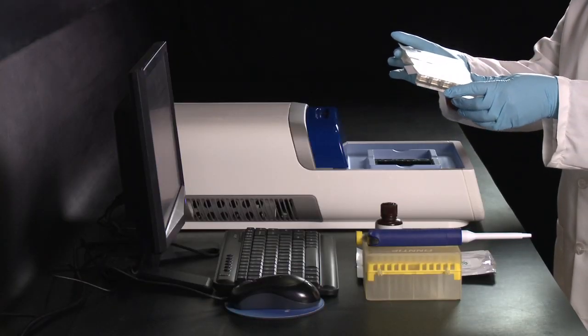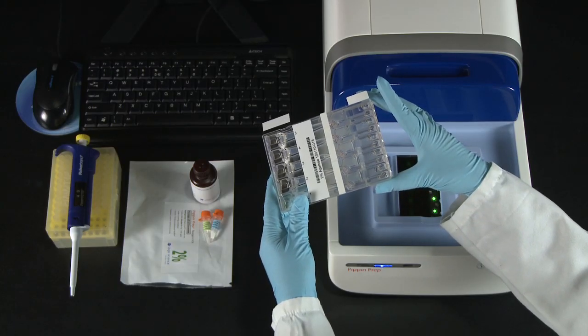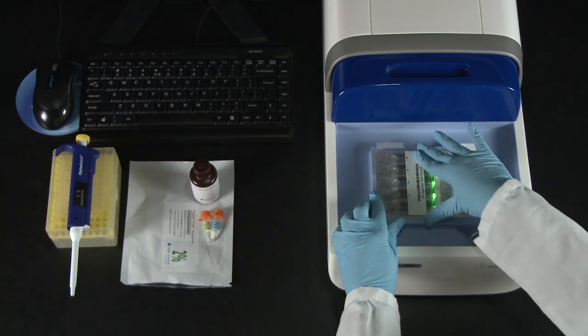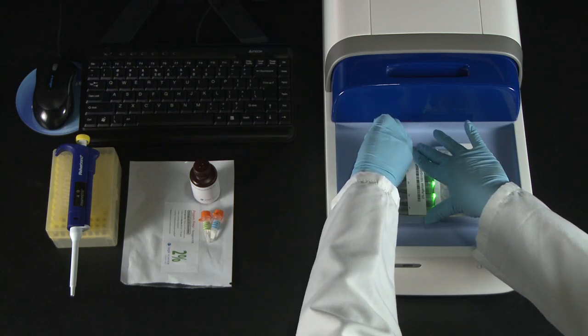Tilt the cassette upwards and to the right to dislodge any bubbles. Place the cassette on the tray, hold it down firmly, and pull the tape tabs towards you.